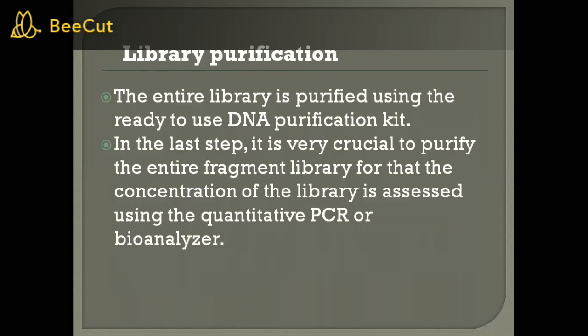After preparation of the library, we have to purify the library. That is library purification. The entire library is purified using ready-to-use DNA purification kits. Many commercially available kits are present. So we can use those kits to purify the entire library. In the last step, it is very crucial to purify the entire fragment library. For that, the concentration of the library is assessed using quantitative PCR or a bioanalyzer.